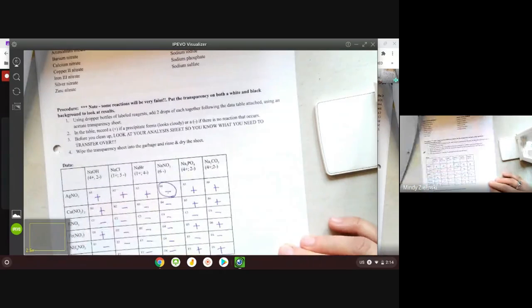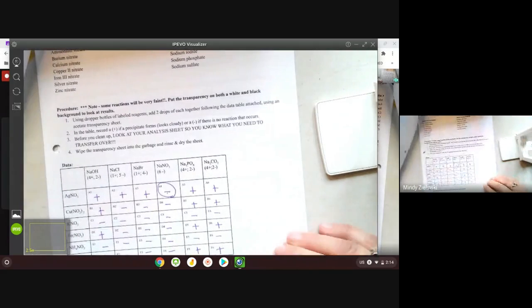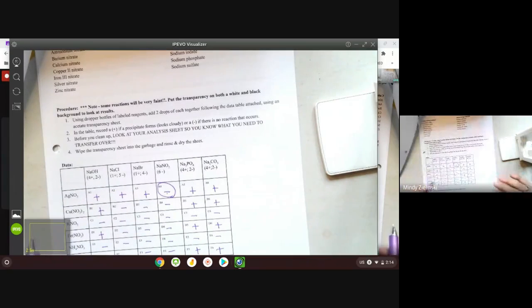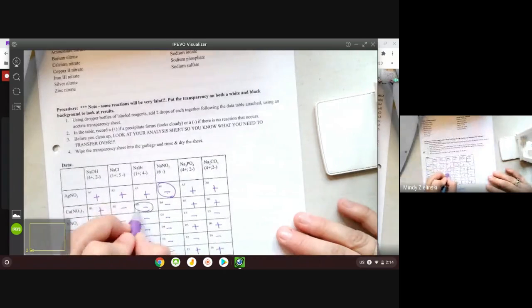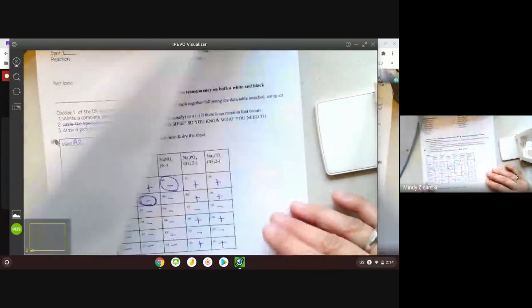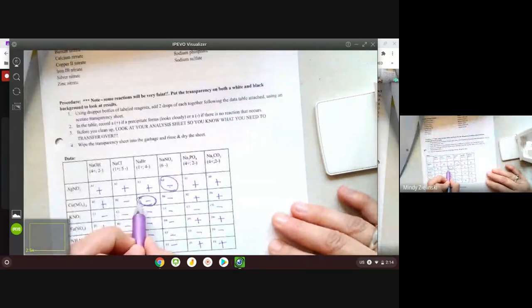So I'm going to write AgNO3, and actually, never mind, because I don't like how it's with NO3 here. How about I pick, so ignore that. I'm going to pick this one instead. So CuNO3 reacting with NaBr. That's the one I'm going to do. All right, so let me put that in. I kind of crossed it out now, but that was well B3.